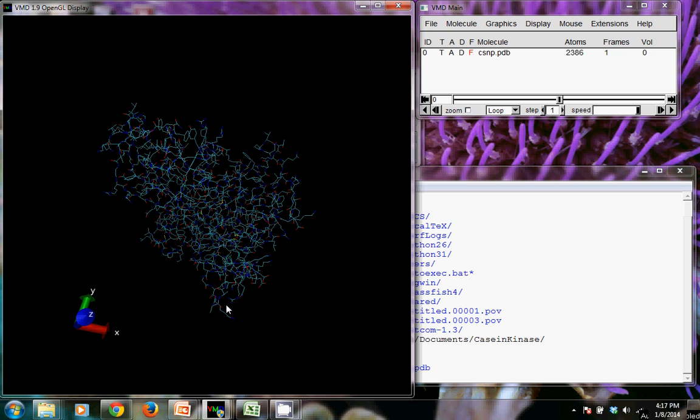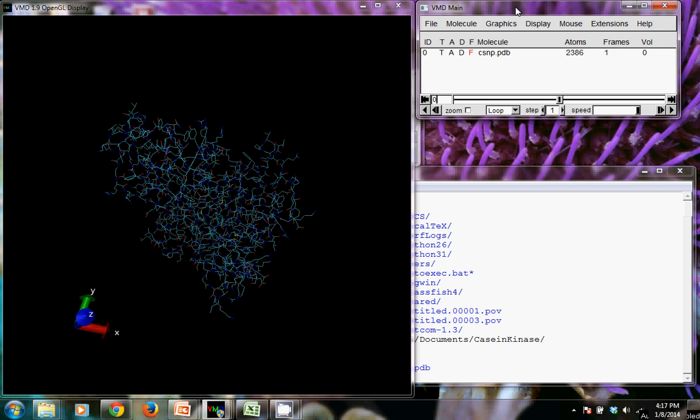So we want to stick as much as possible with the basic functionality that we can get through VMD. We're going to be using all of the graphical user interfaces that are available here, but be aware that you can do all of these things manually through scripting if you're a more advanced user.